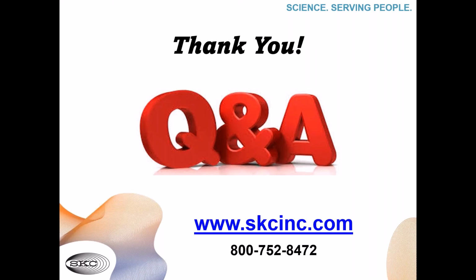And we do have a few questions. Not only do we have our presenters joining us for Q&A today, but we also have 2 other panelists, Cindy Coleman and Chuck Knockreiner. Cindy and Jay, I think I'd like to start with you with this first question. It says, regarding air velocity for passive samplers, if a building has an HVAC unit, is that sufficient to generate air velocity for a passive badge? Essentially, what should we be looking for to constitute sufficient air velocity for a passive sampler? Jay or Cindy, would you like to take that one?